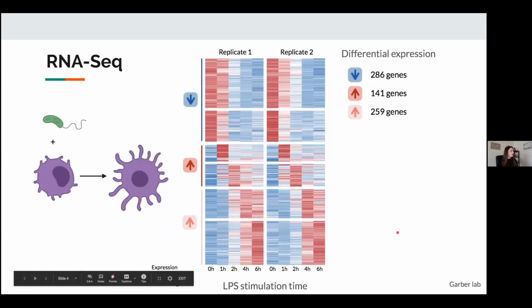So the result of this change is very dramatic, like I said. The transcriptional landscape of these cells changes drastically, and they upregulate around 2,000 genes and downregulate an equally large number of genes. And I'm showing you only part of them here in this heat map.